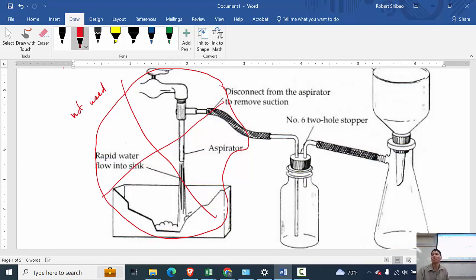Instead, we use a mechanical vacuum pump, and so we have just this pump. You have suction pumps, or you can have air pumps that generate pressure, but it depends on which side. If you have an air pump that generates pressure to inflate tires or whatever else, it creates a vacuum on the other side, so we can use that vacuum. And so we have house vacuum. It's pretty weak. Do you hear that? Some house vacuums are a bit stronger.